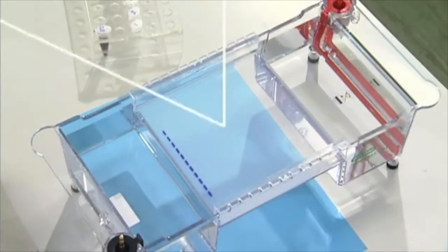This allows the molecules of the substances to flow at a different rate depending on the size of the molecules. The larger the molecule is, the slower it flows through the gel. Smaller molecules flow through the gel much quicker than the larger ones, so they are closer to the positive side of the chamber.